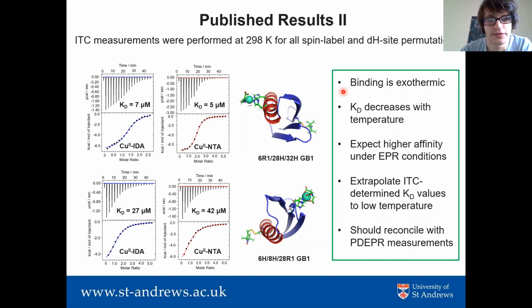I think it's a really good point. So perhaps I start more generally. The beauty of these labels is that the binding is exothermic. If the binding were not exothermic, and it isn't always, there are other protein ligand interactions that are obviously endothermic, then in that case, study with pulse EPR is probably limiting, assuming that the kinetics of your association are very fast with respect to the rate of cooling.